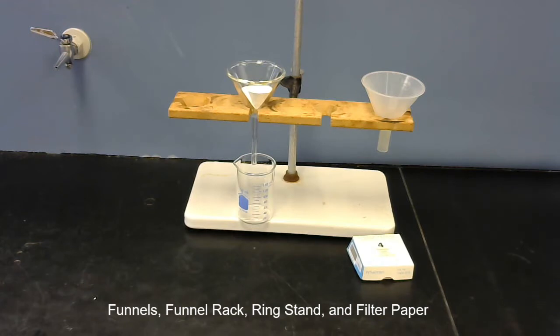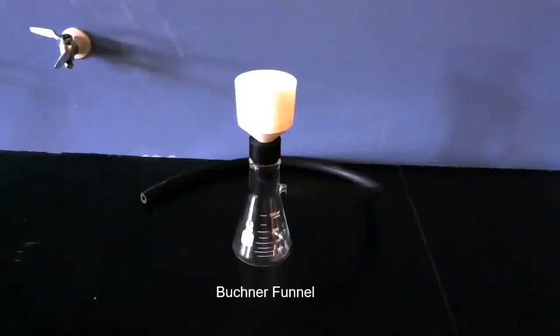This is a Buchner funnel, or some people just call it a filter funnel. You would put filter paper in the top and use that to separate a solid from a liquid, say a solid precipitate.